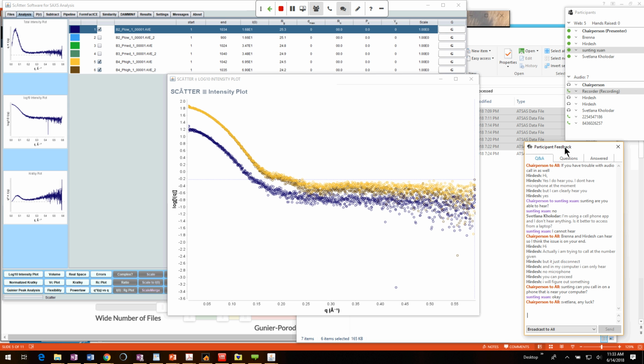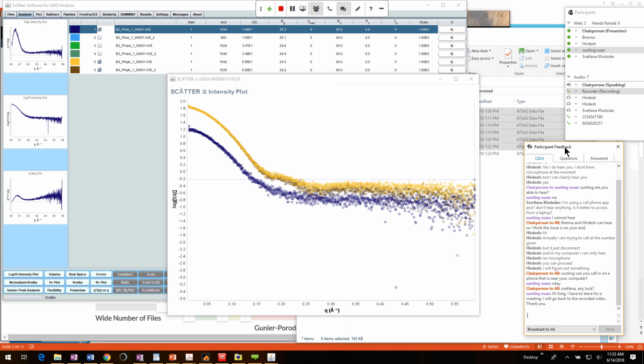I use chi-square as something to minimize on. Sometimes I'll have a really nice curve with very small error bars, and the chi-square will be like 13 or 14, and it's just because the error bars are so small that the number is so big. Whereas if I have a really noisy curve and the error bars are huge, I'm getting chi-squares of 1 or better. That's just because the data quality is so poor, it can't give you that sense.